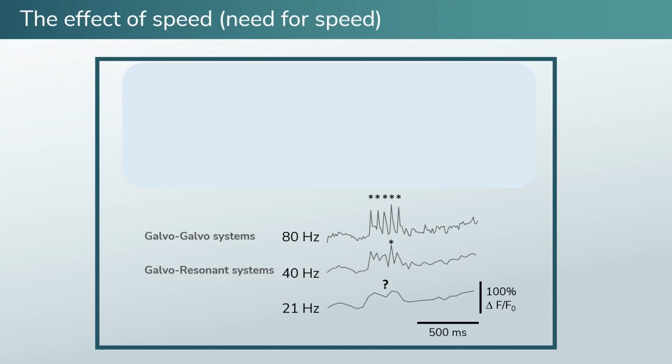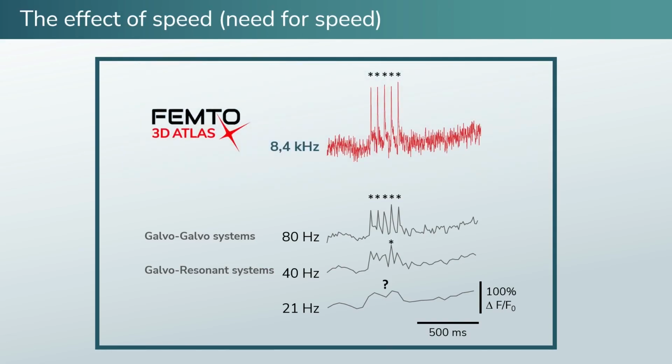But here we have the new acousto-optical scanner-based three-dimensional Femtonics 3D AO scanning microscope. And look, we may achieve the speed that is required to record those voltage signals.